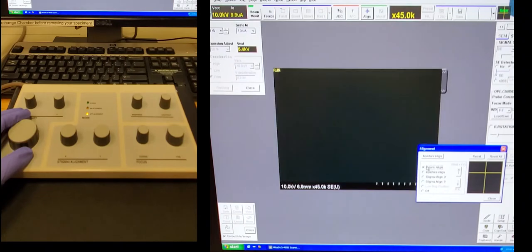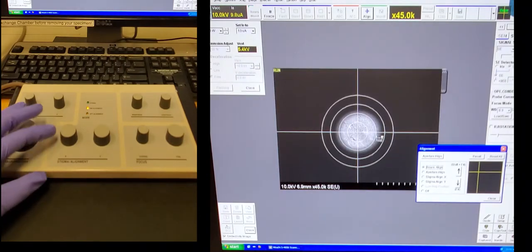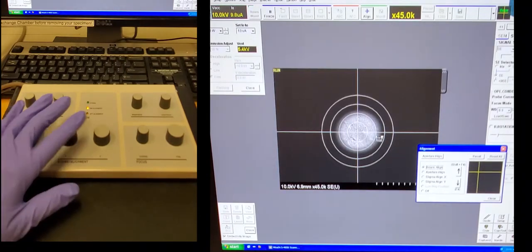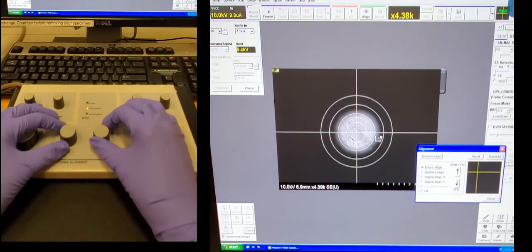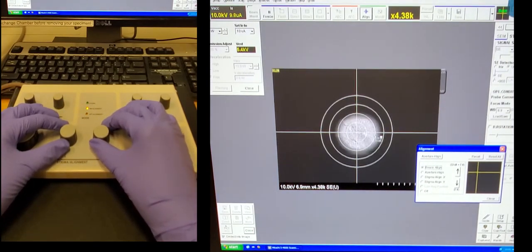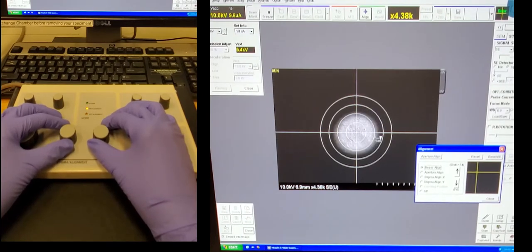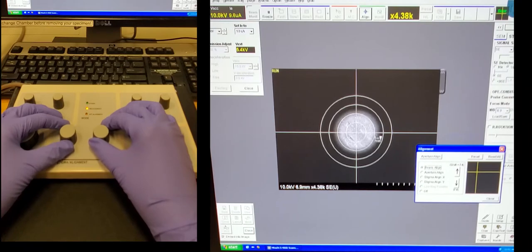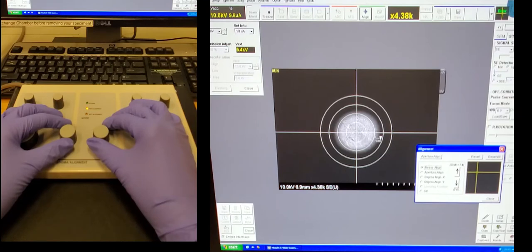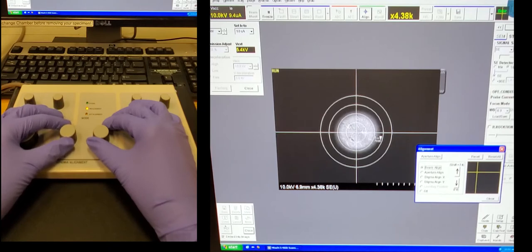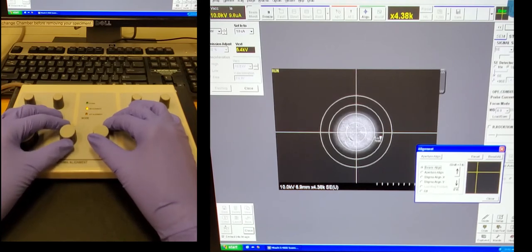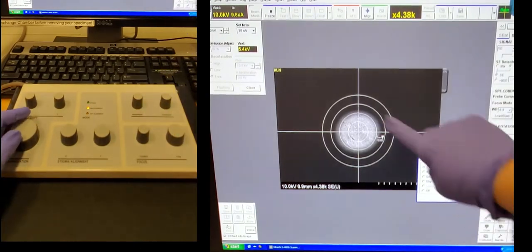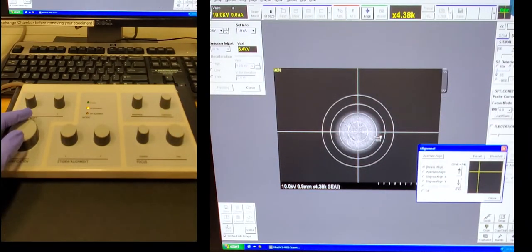Next we click the align button at the top. We're going to start at the top one for the beam align. So use the center two buttons to move the beam in x or y direction, and make sure you put it in the center. It's very sensitive, so you only need to make very slight adjustments. Now it's in the center and this looks good.